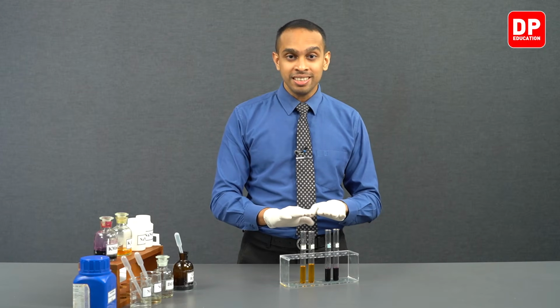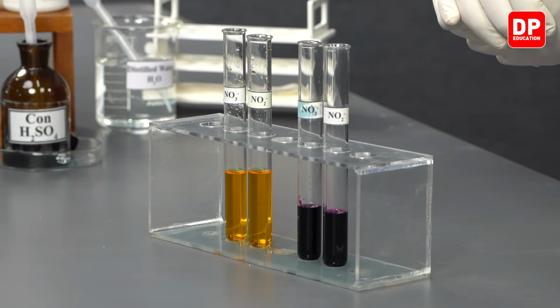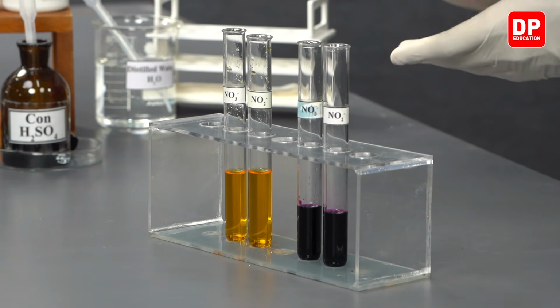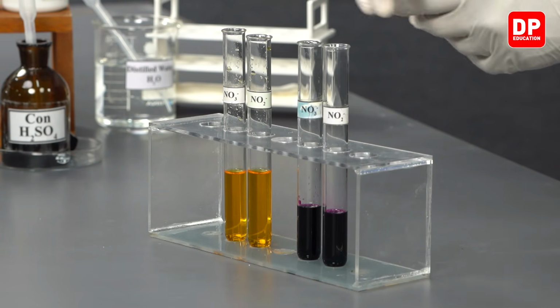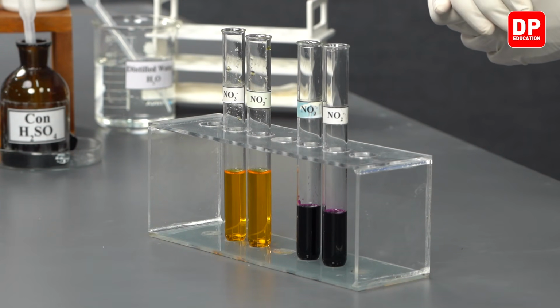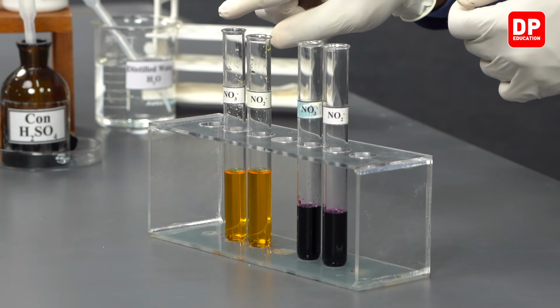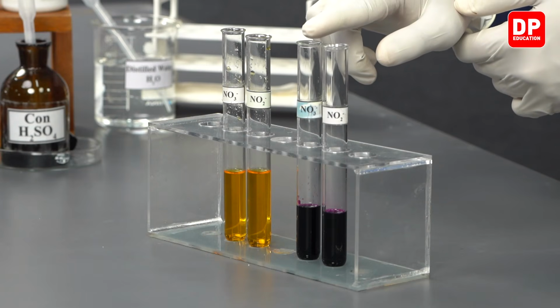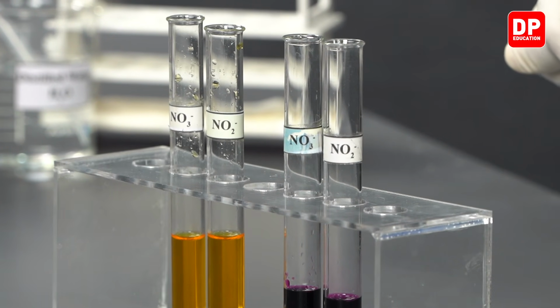So over here we have 4 test tubes, and 2 of these test tubes are labeled nitrite ions and the other 2 are labeled with nitrate ions, with the chemical symbol and nitrate ions formula. So this test tube, we have nitrate and then nitrite. We have nitrate and nitrite formulas written here on these labels.